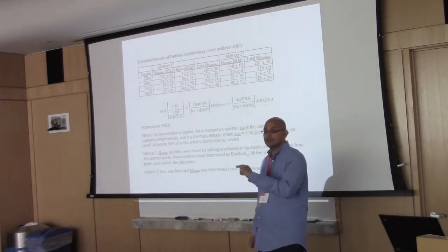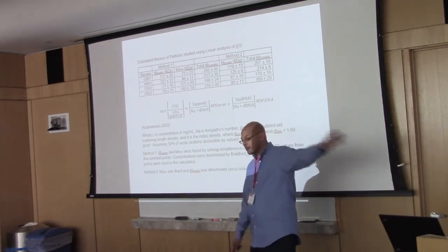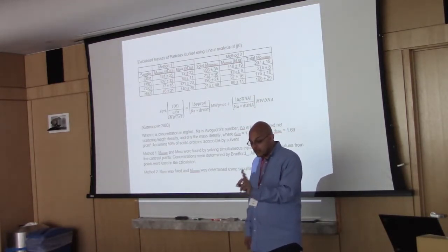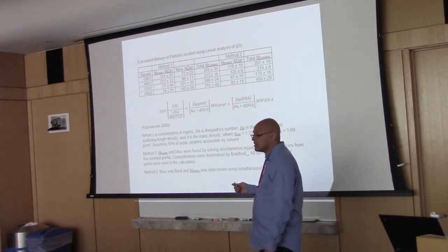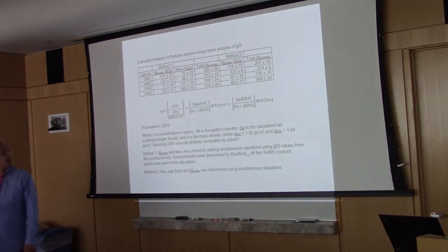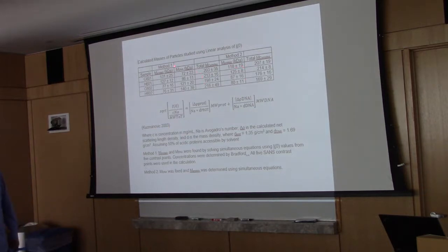I mentioned this morning how important concentration determination is. This was a major roadblock for a long while. We had to go back through all these notebooks for several years, because we were using one form of concentration determination, which turned out to be 30% off in concentration, which you might get away with in just simple structural modeling. But the nice thing about contrast variation, that I is 0 term, is that it's exquisitely compositionally sensitive. You should be able to back calculate from all this neutron data the precise molecular mass, corroborating the molecular mass for your particles. And we can do that.